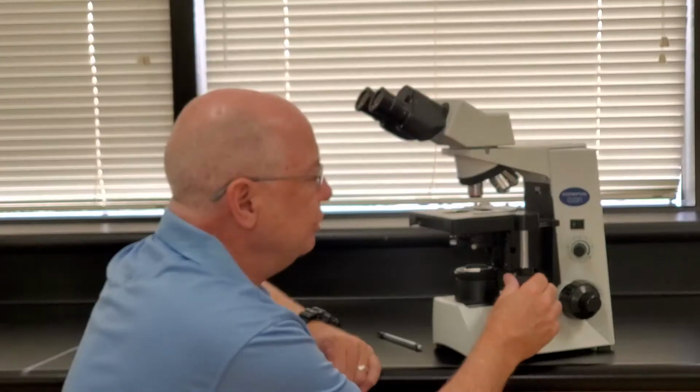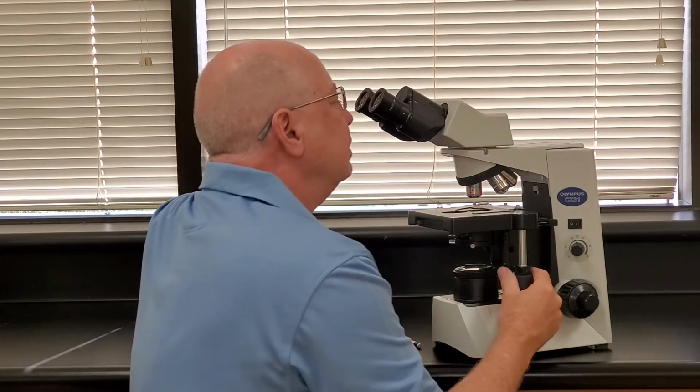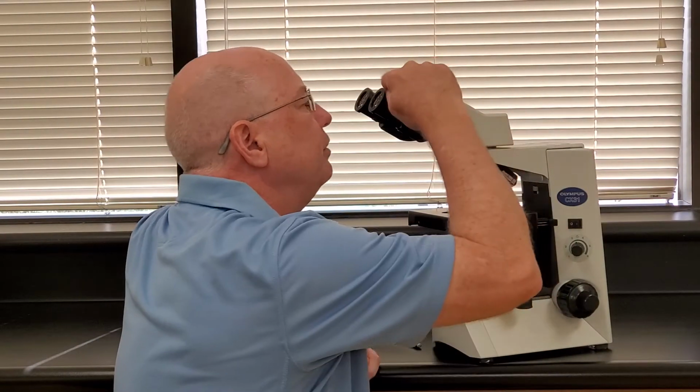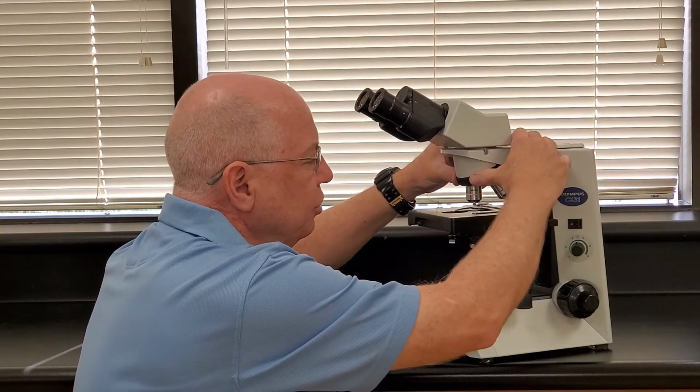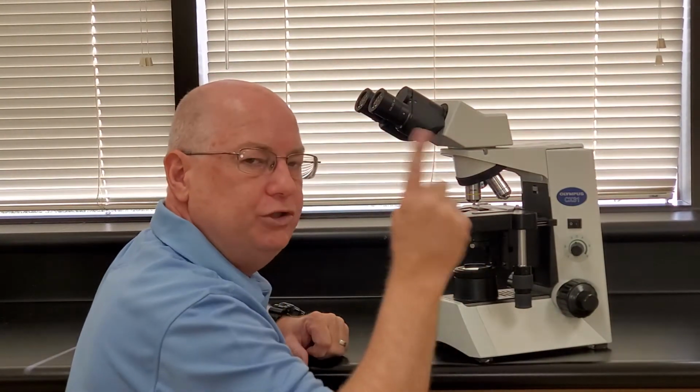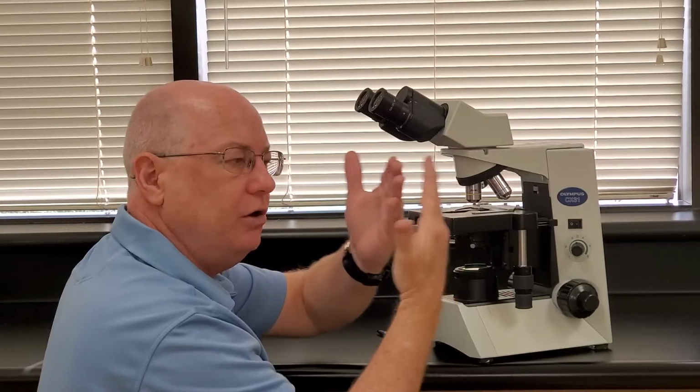If you need to, you can move the slide around a little bit to see things, and like, oh, I want to put my pointer, there's a pointer in here. Look at whatever you want to see in detail. If you need to go up in magnification, then you go to the next highest magnification. Once you switch objectives, they should all be very close in focus.